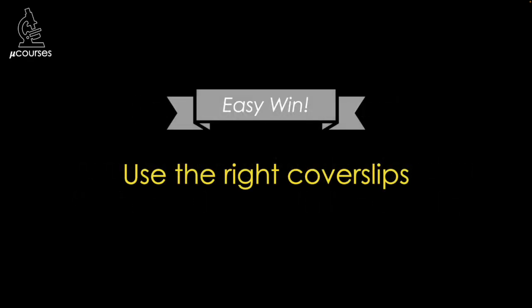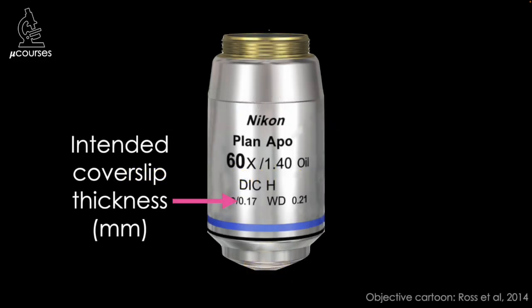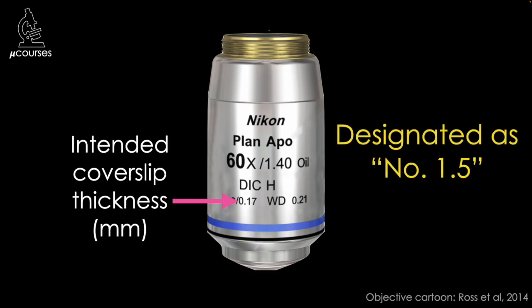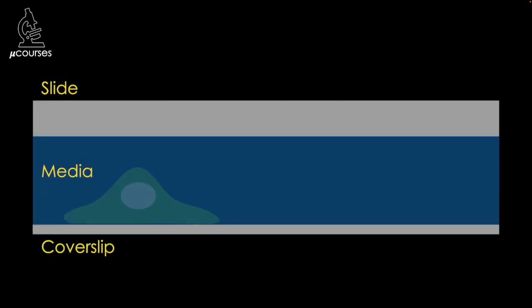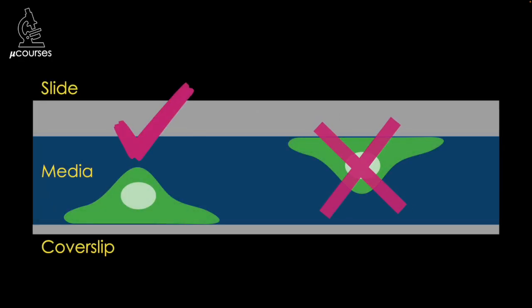One of the easiest things you can do is to make sure you're using the right coverslips — the type the optical engineer who designed the lens assumed you would use. Most objective lenses were designed to image through a coverslip of a particular thickness, marked on the barrel of the objective in millimeters. You'll most often see 0.17 millimeters, which corresponds to a coverslip graded as a number 1.5. Next, try to get your object of interest as close as possible to the coverslip, because spherical aberration increases as you focus farther away. Every micron counts.